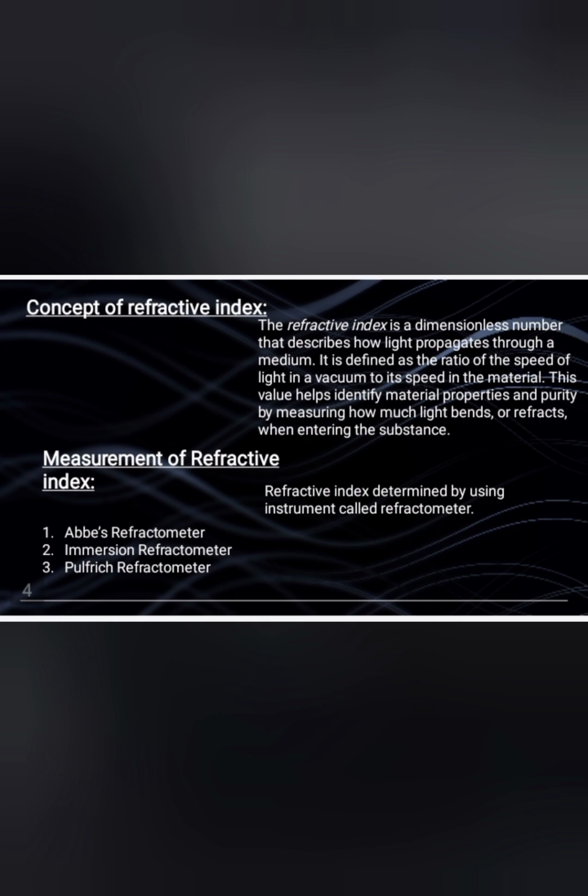Concept of refractive index. The refractive index is a dimensionless number that describes how light propagates through a medium. It is defined as the ratio of speed of light in a vacuum to its speed in the material. This value helps identify material properties and purity by measuring how much light bends or refracts when entering the substance.